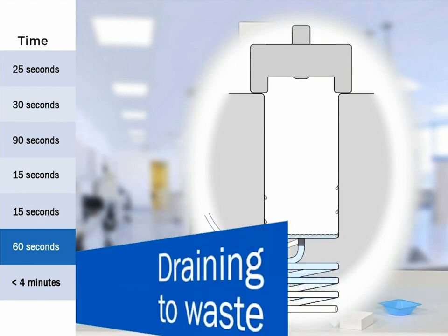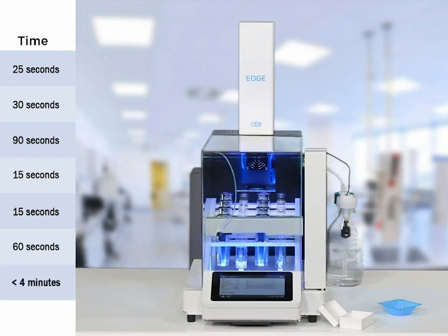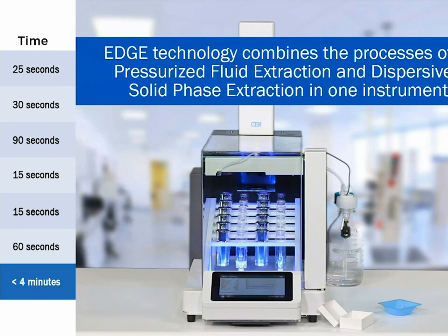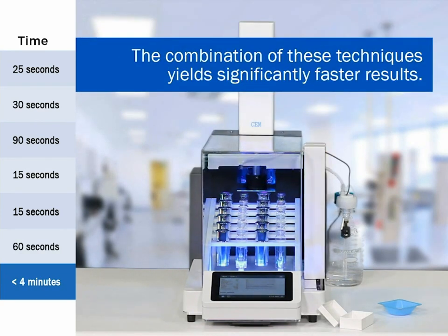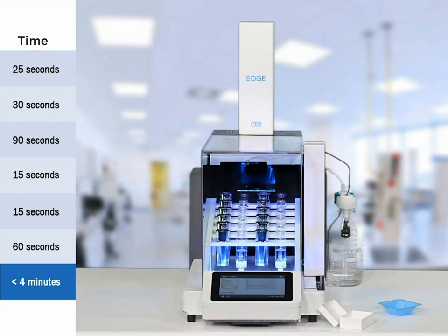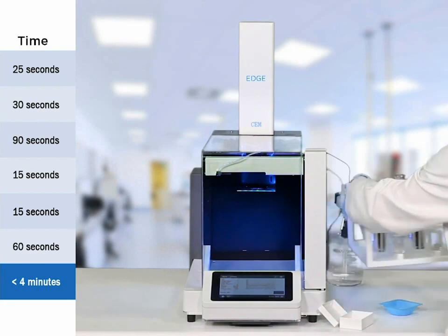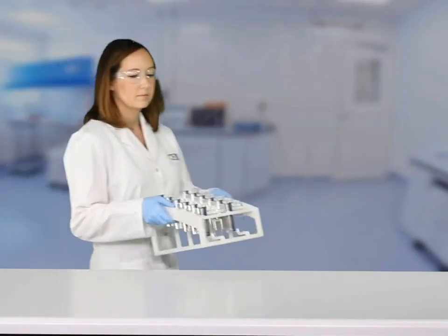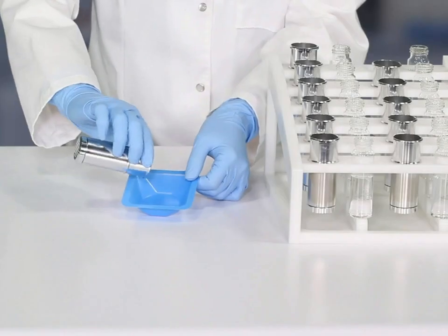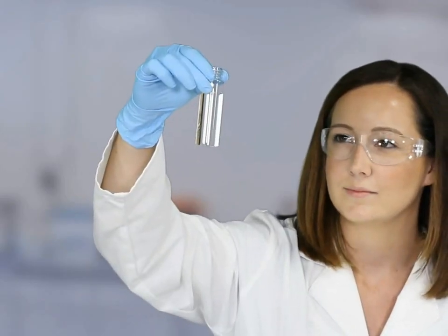At this point your extraction is done — you could literally grab your vial and move on to analysis. Our system is a 12-place series system, so washing follows. We make sure the entire flow path that saw your extract is washed. You can program up to five washes at up to 30 mL per wash. Once washing is done, you're moving on to your next sample. The extracted sample is pulled out bone dry — we've got the entire extract and we're ready for analysis.